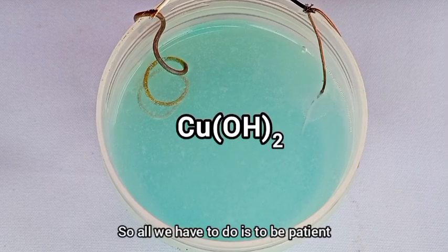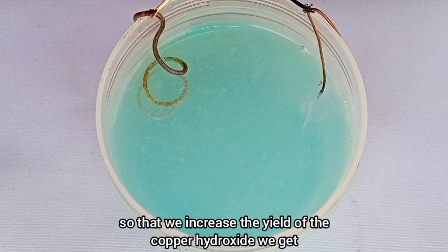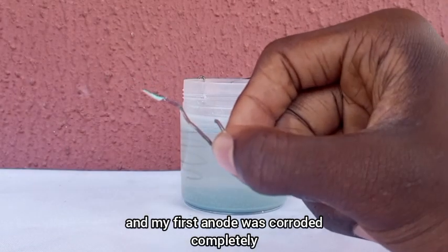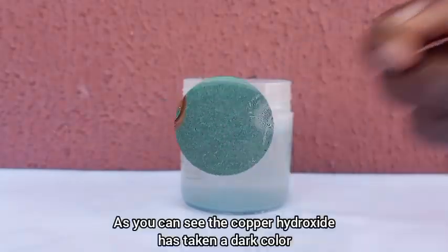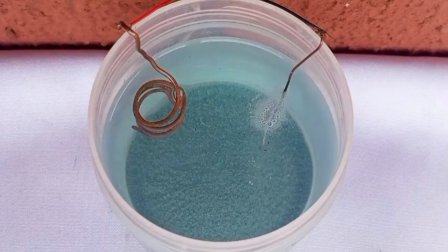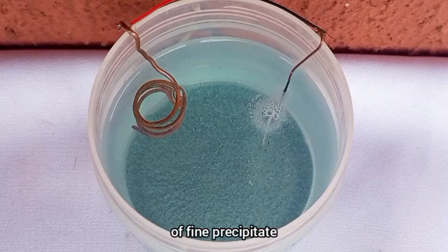So all we have to do is be patient so that we increase the yield of the copper hydroxide we get. The electrolysis ran for about 2 days, and my first anode was coated completely, so I had to replace it. As you can see, the copper hydroxide has taken a dark color and a lot of it has settled. This tells us that we have a good concentration of fine precipitate.